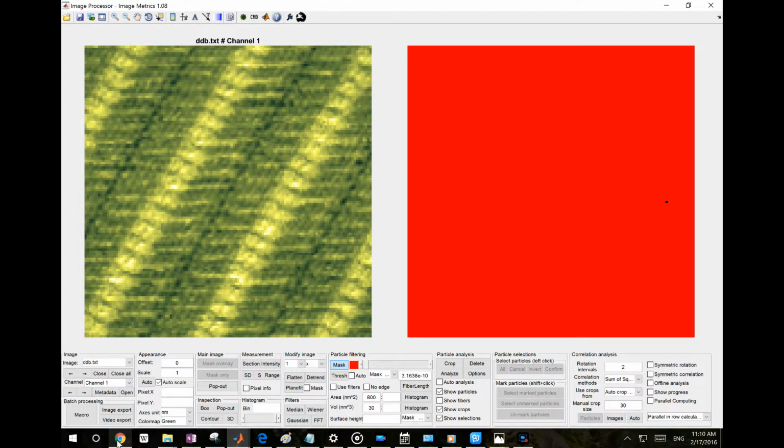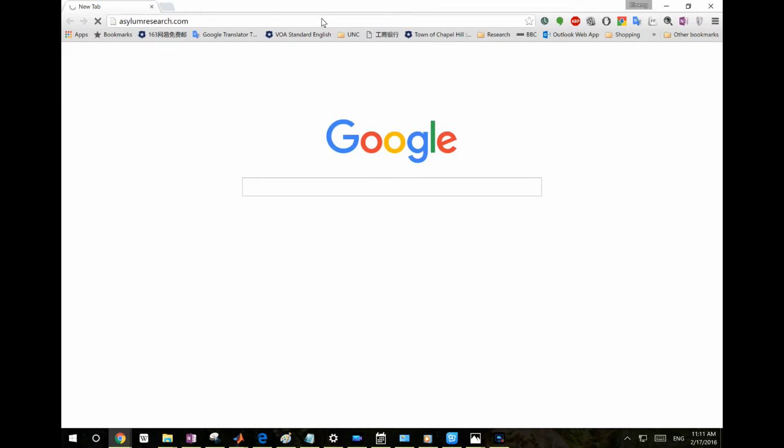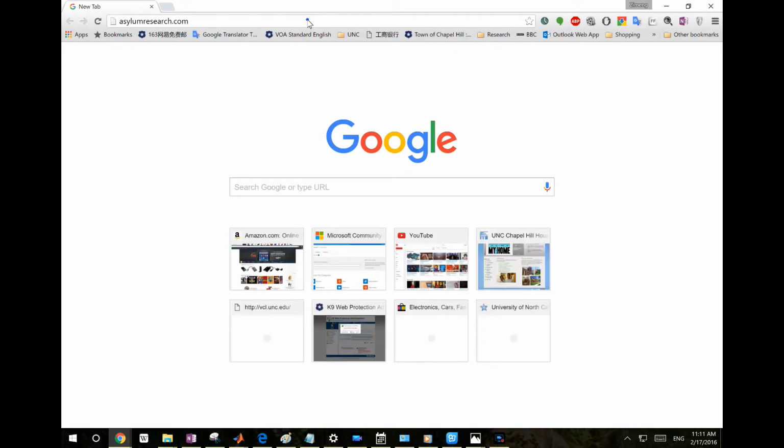Why don't we use something more interesting? I'll go to a website and download some nice periodical images so that we can do some real examples. Let me try to open a science research website, the manufacturer of AFM.